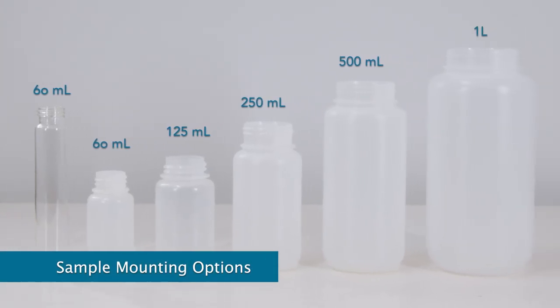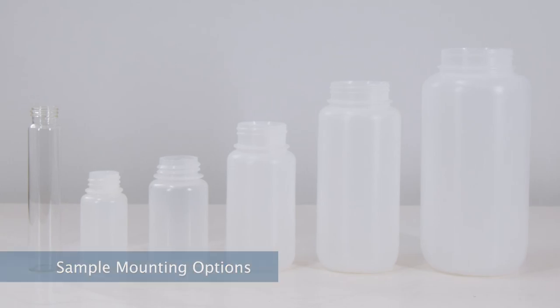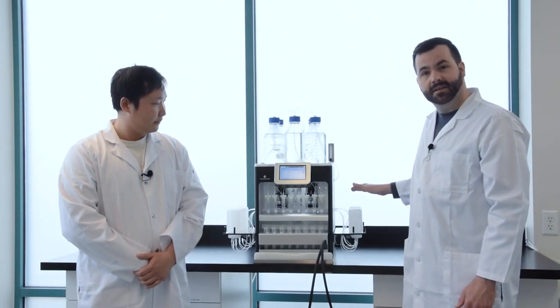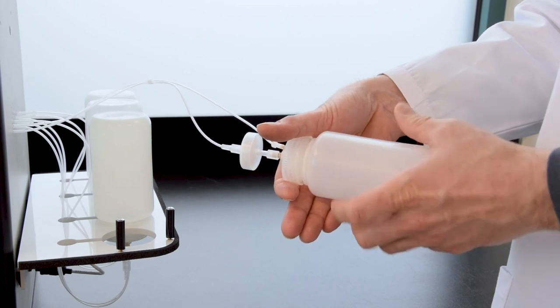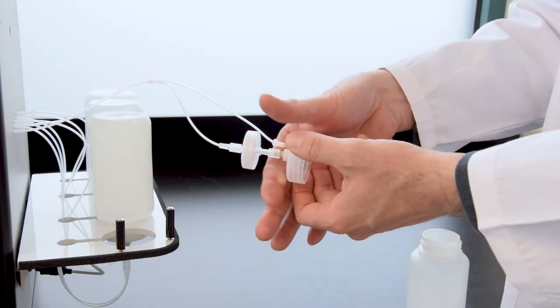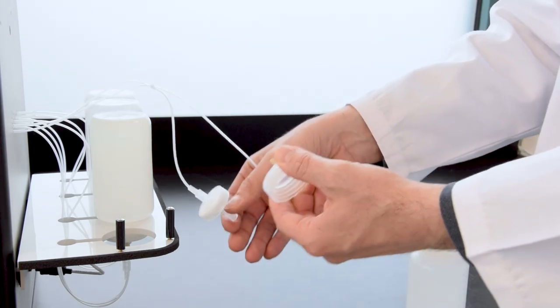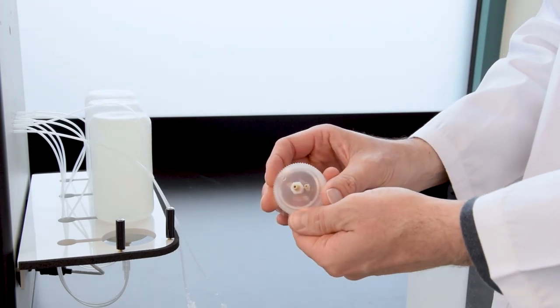You also mentioned that the Mod00P configuration is compatible with a wider range of sample sizes? Absolutely! Allow me to go through all the mounting options for EPA Method 1633. These racks here are compatible with any plastic bottles up to 250 milliliters. The upside-down mounting maximizes sample transfer and is easy to attach the bottles. The adapter caps can also be taken off to be sonicated if necessary.